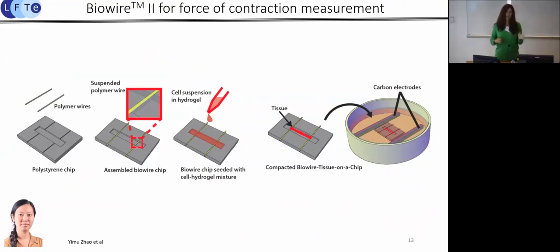And the reason we did that is because PDMS is well known for its ability to absorb small molecules, such as drugs, and release them over a period of time. So we got rid of PDMS. Now we have a plastic platform.